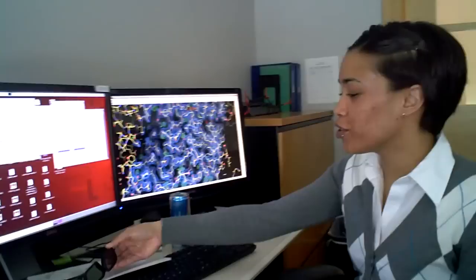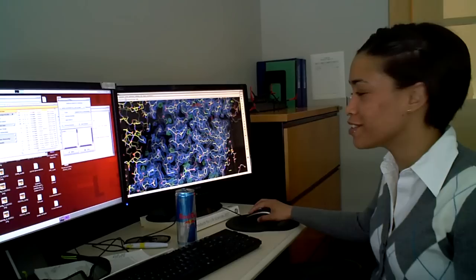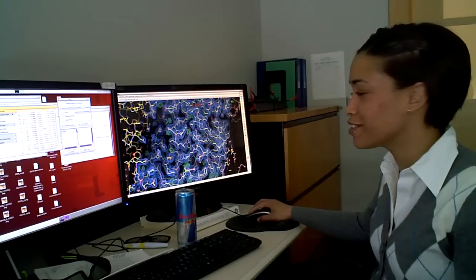This is our computer room where we index, integrate, scale, molecular replace, and process all of our data and solve structures.